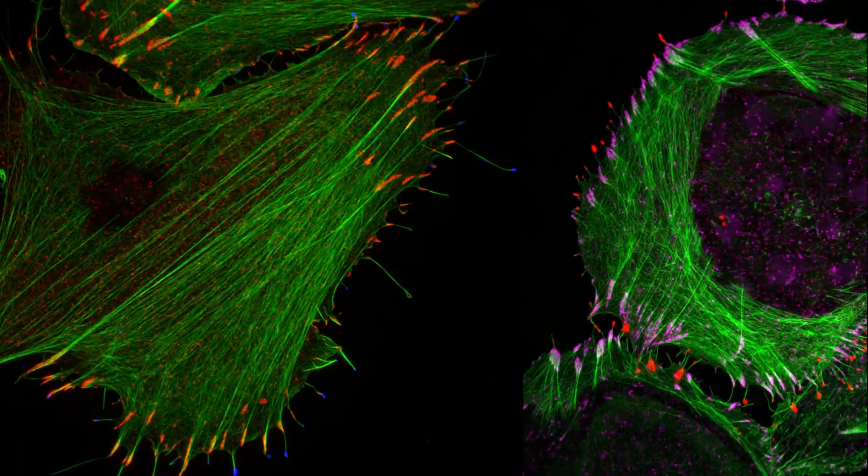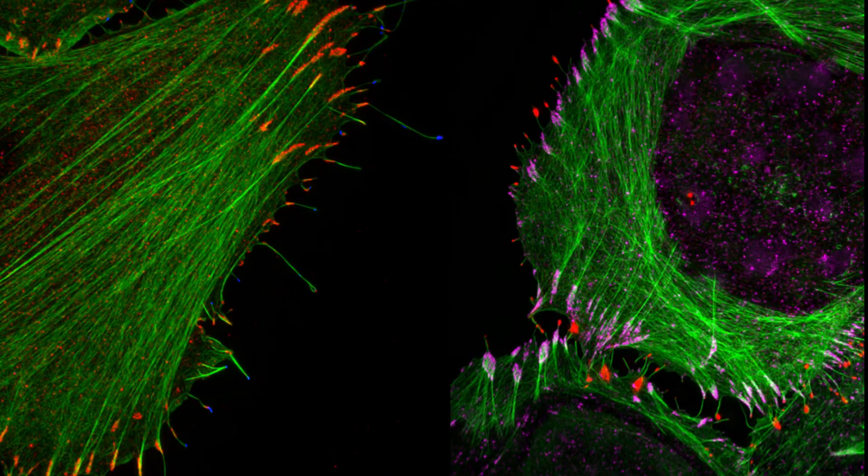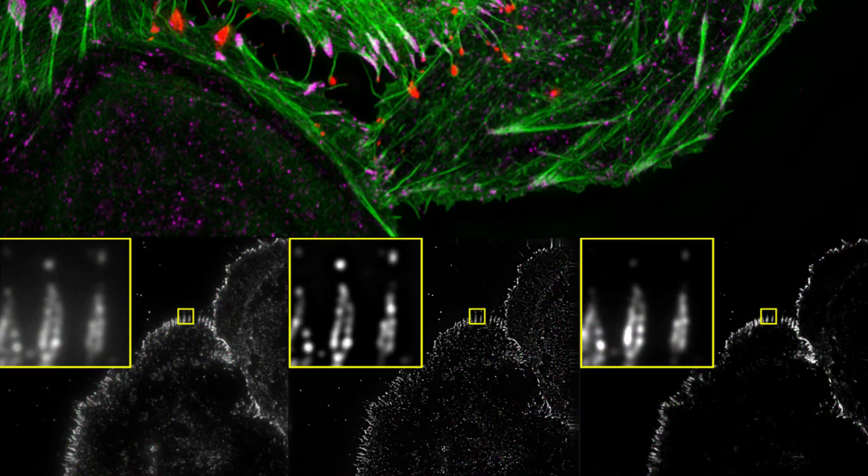One of the big advantages of SIM is that you can use just standard fluorophores for the most part. It's very easy to move straight to it from a typical wide field or confocal type microscope. The localization techniques do need some special fluorophores and special chemistry to make them work. Our SIM hardware is very fast, so it's able to actually do ultra or super resolution for live cells. We have three different cameras and they're high speed sCMOS cameras, so they can actually outpace the SIM even — they're very quick.